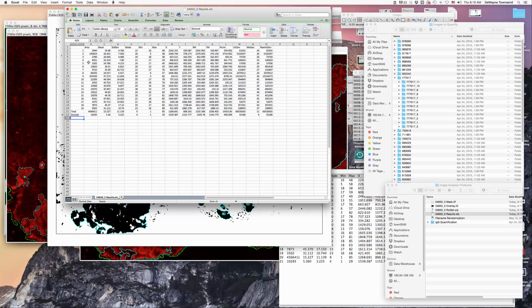So we will then have a program that runs through, collects these images, recognizes the numbers as lesioned areas, the total as the total, and the exclude as the areas we were trying to get rid of. So the total area is going to be the sum of things labeled total, subtracting the things that are labeled exclude.